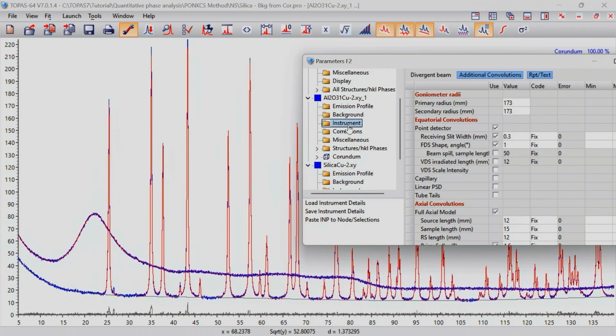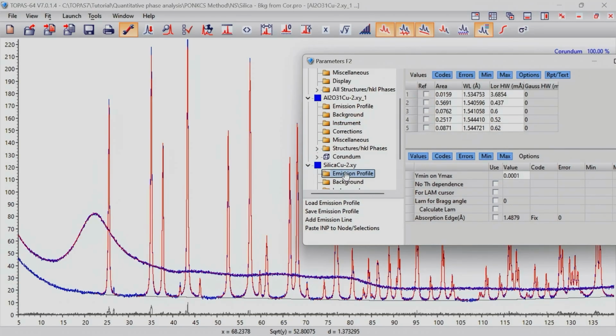So this is just for demonstration purposes. What you would do typically is, for example, put it in a macro, but it could go also in a file which is called topaz def, if I remember correctly, where you can enter some defaults. And you could force Topas always to start up with these background functions at the beginning.